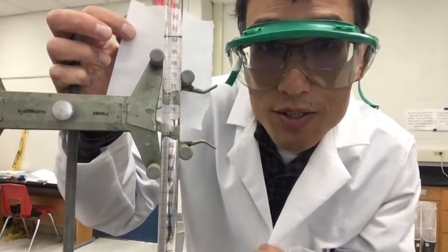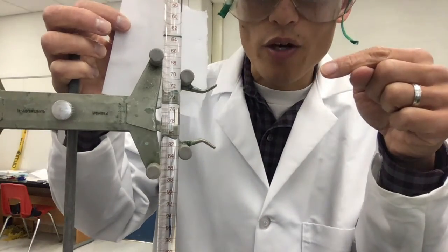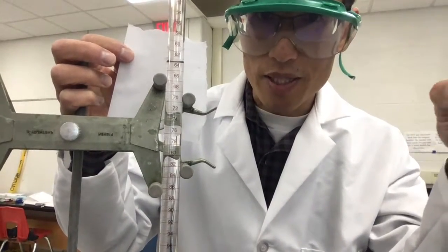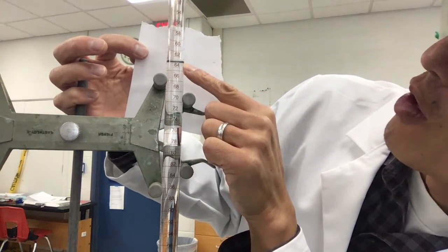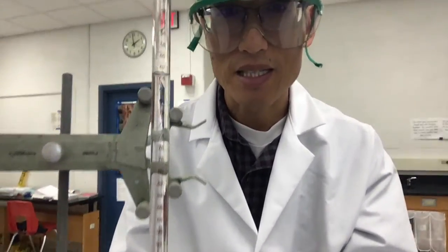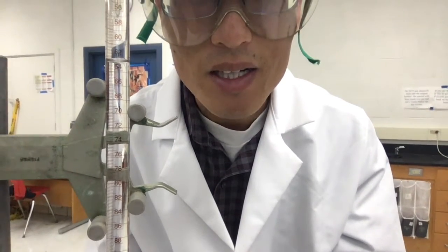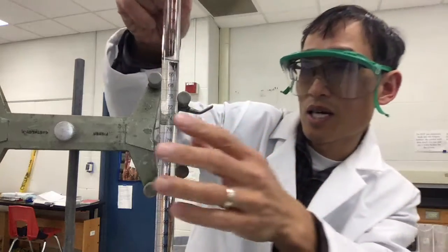The other thing you've got to know is, when you see a line, whatever that decimal point is, your estimation is to the next decimal place. So if I have 62.0, 62.2, 62.4, 62.6, 62.8, and it's right on the line, 62.8, I'm going to call that 62.80. It's kind of hard to see, but hopefully you can see that. I know it's not the right angle, but you read the bottom of the meniscus, so you want to get right to eye level. Okay, I'm reading that.